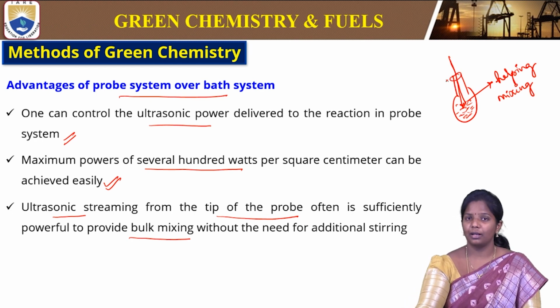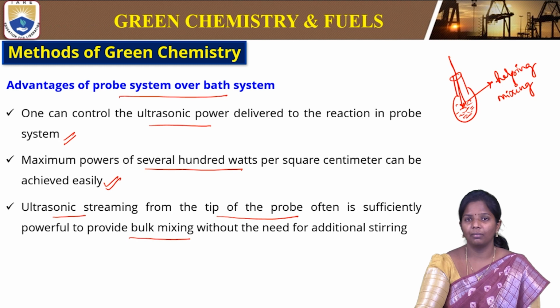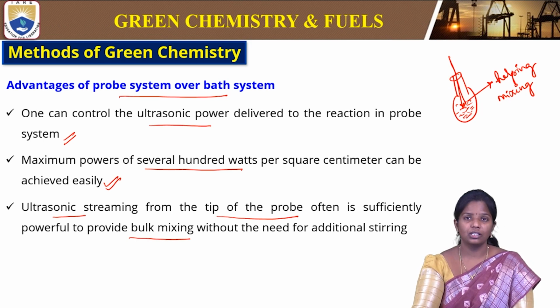When it is immersed into the bath, the mixing happens because of a transfer of these waves into the vessel, and that takes longer time when compared to the probe method. In the probe method, it is very easy to get bulk mixing without any stirrer beads. We need not use any additional stirring to achieve mixing.